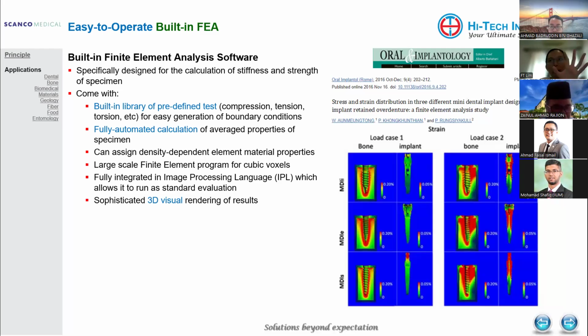For the human one, it can basically load up to about 1 foot, 12 inches, 30 cm of diameter.